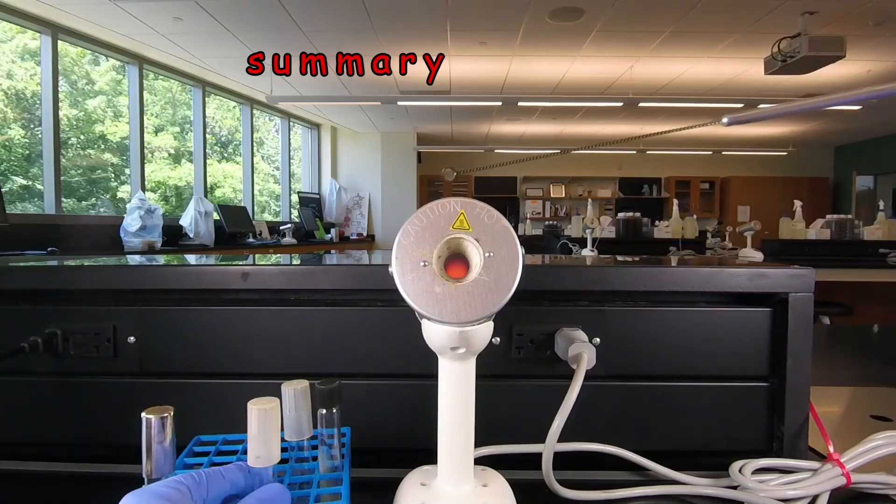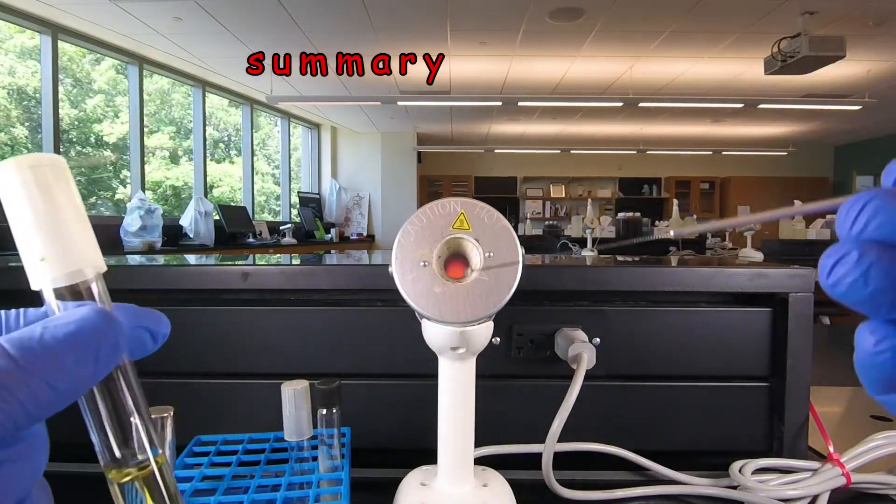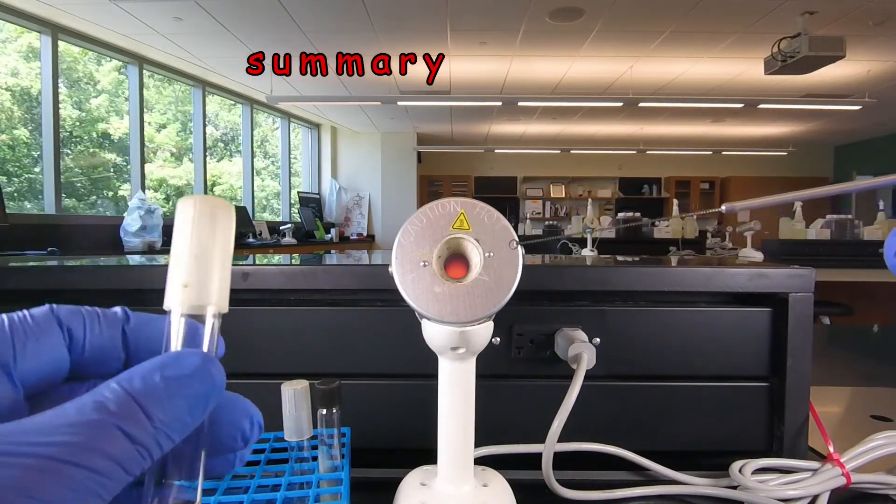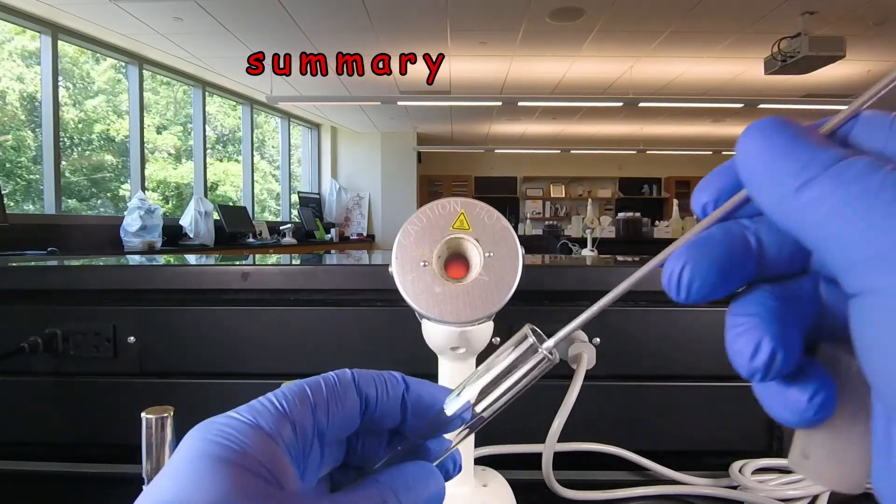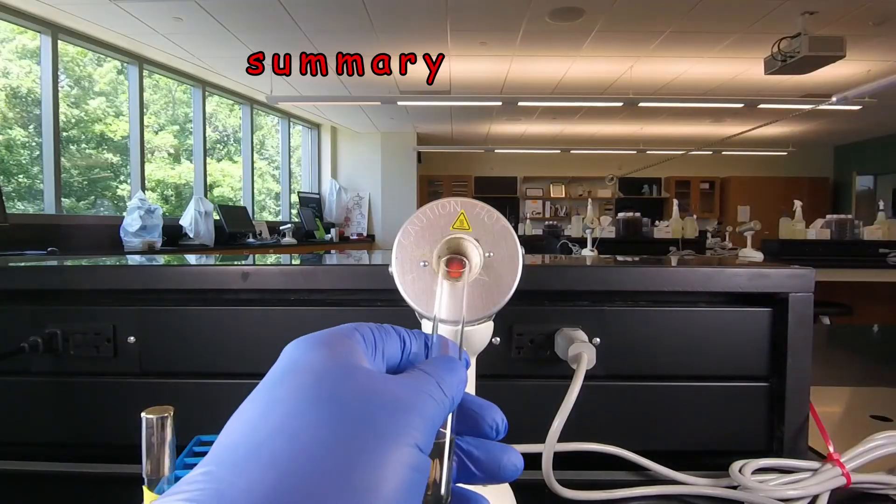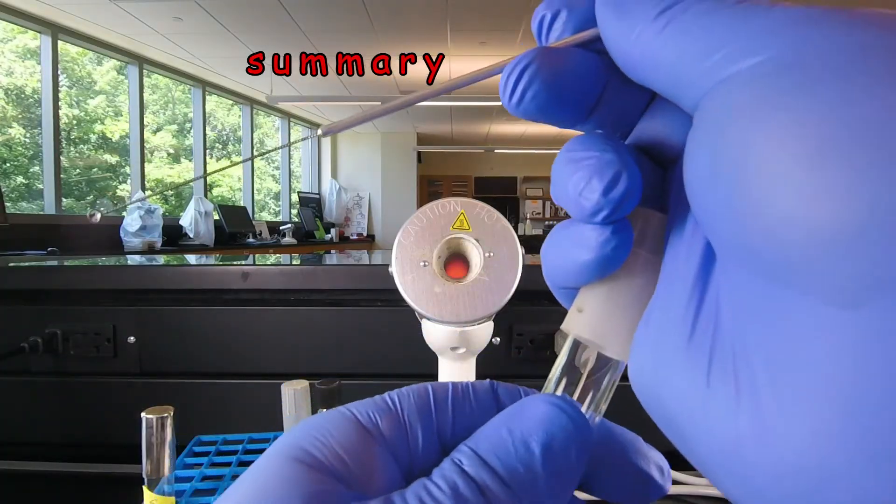And then when we do our inoculations we do the same thing. We have bacteria in the loop we're going to put it into the tube so we'd remove the cap, flame the tube, put the bacteria in, flame the tube and put the cap back on.